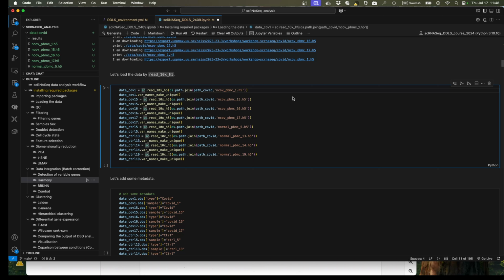Instead of copy pasting the path, you will have this structure, and this can also be delivered to your colleague or your team, so it will be a bit more reproducible instead of having a path, for example, desktop Nima. Here you are working within the working folder, and all of these files based on relative path will be accessible.